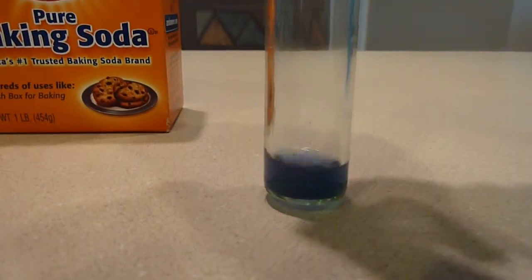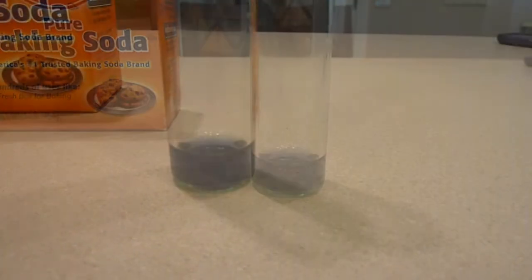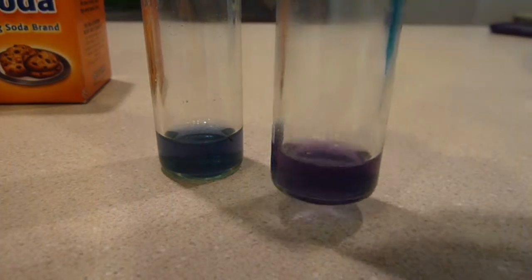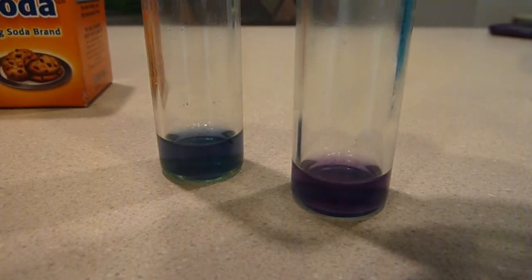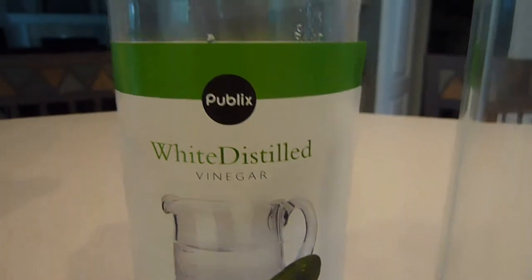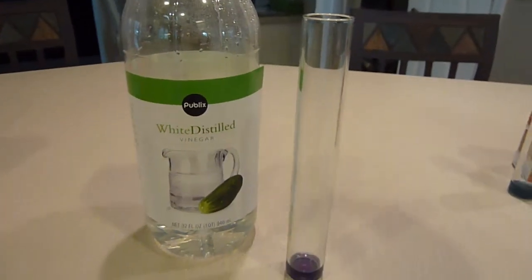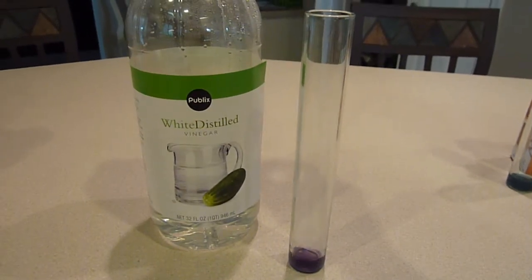10 drops of the baking soda solution were added to one of the test tubes containing the purple cabbage juice. You can see that the color has changed. If we compare it to our control, you can see how the original color compares to the color after adding the baking soda. 10 drops of vinegar were also added to another test tube to see the color change there.